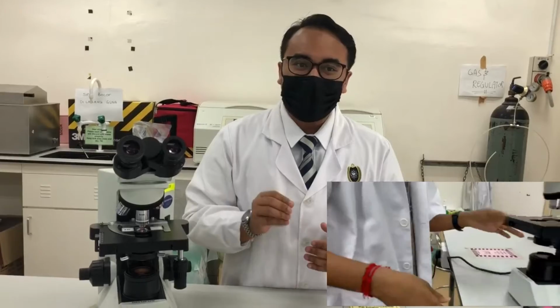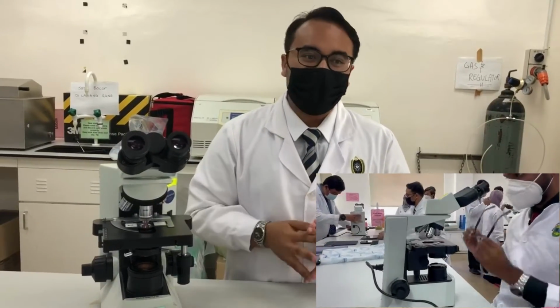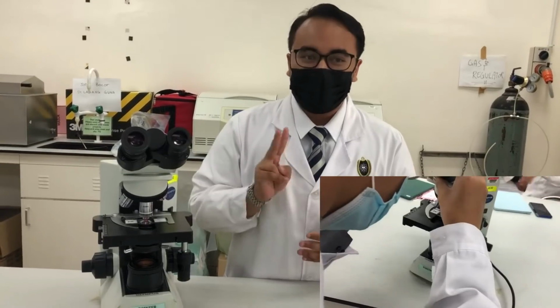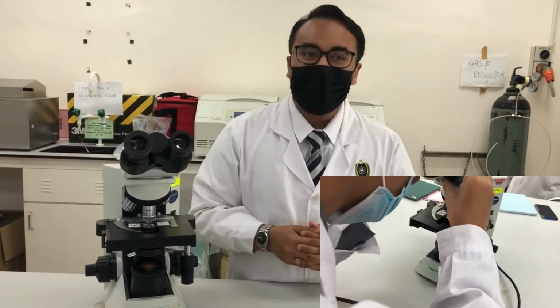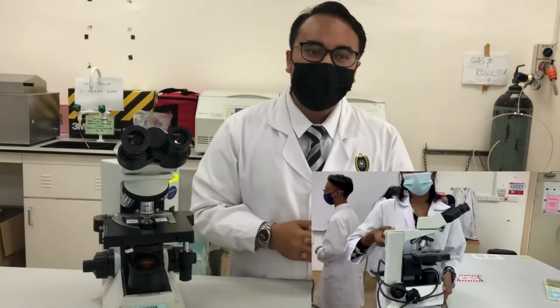Today, we would like to share with you all about handling microscopes. So now, we will discover the 5 steps to handle the microscope. The first one is setting up the compound microscope. Second, focus on the specimen. Third, using oil immersion objective lenses. Next, cleaning of oil immersion. And the last one is storage of the microscope. Now, let's go and see it.